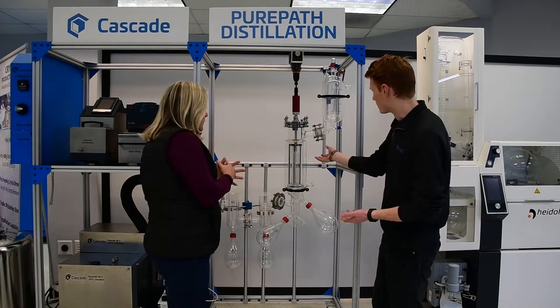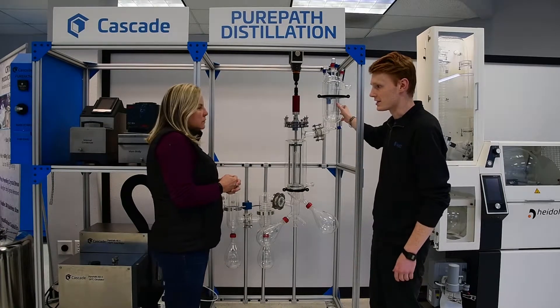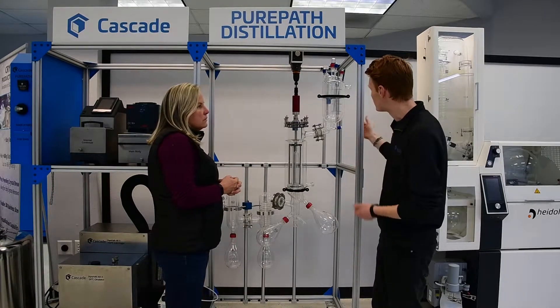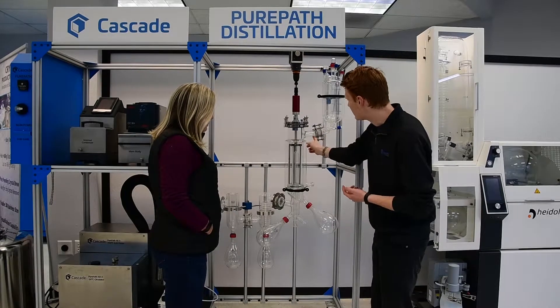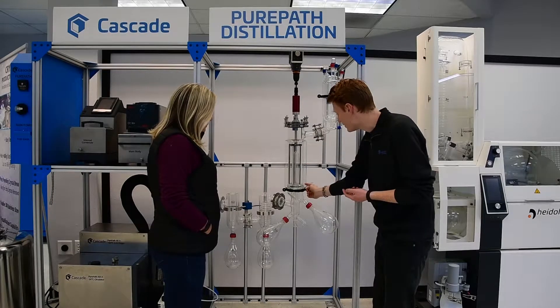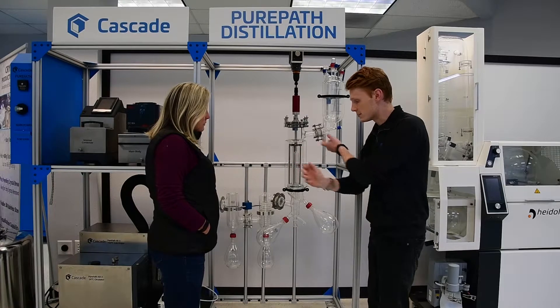So how this works is you start by putting some crude into this feeding flask here. It's kept warm — it's jacketed so that it stays thin enough that it can flow through this little tube right here. It'll dribble down into the inside of this wiped film system.